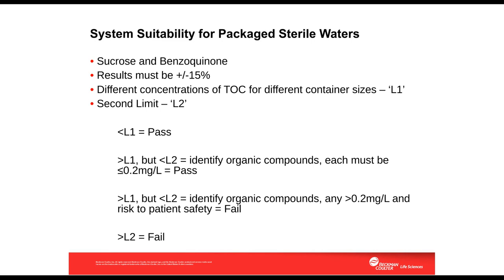If, however, the reported TOC value from a water sample is higher than L1, but lower than the second defined higher limit L2, the user is required to determine exactly what organic compounds are present in the water using a suitable analytical procedure. If the quantity of every organic compound present measured individually is less than 0.2 milligrams per liter, which is less than or equal to 0.2 ppm or 200 ppb, then they are deemed not to be present in a quantity that may be harmful to patient safety.